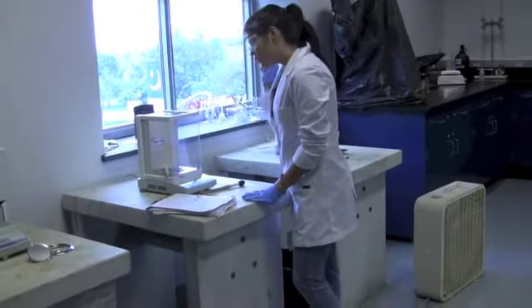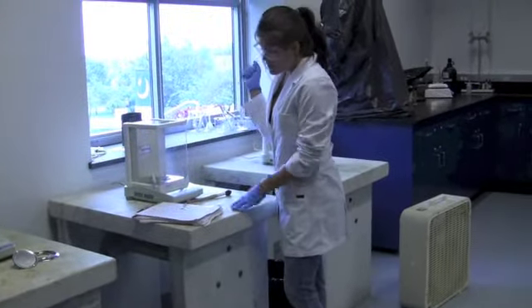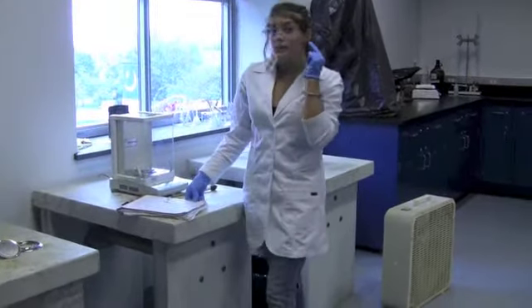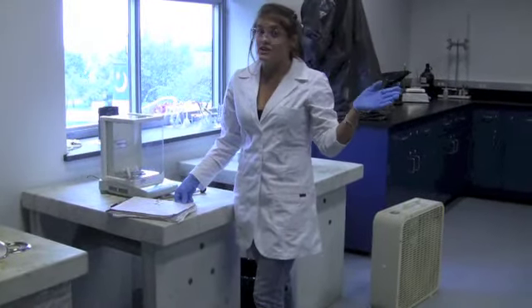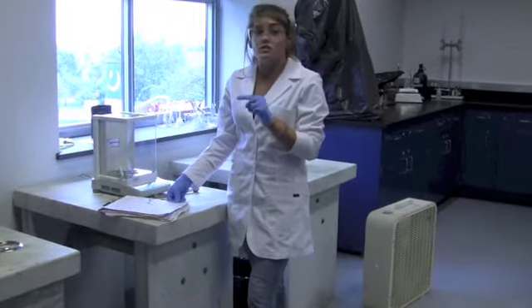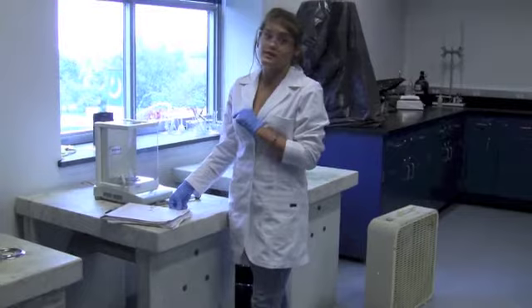My reading is 0.5186. So I brought my lab book back with me so that I didn't have to try and remember the number on my way back to my station. Always remember to bring your lab notebook back, and always remember to record to 4 decimal places.